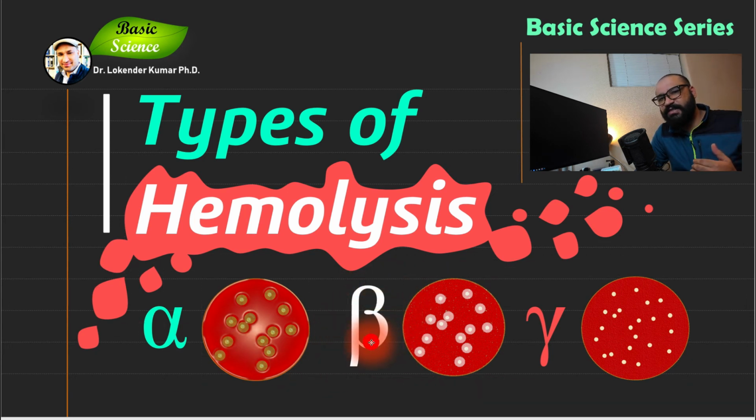Beta hemolysis indicates that there will be complete or true hemolysis, and the zone will be clear. That is why I'm using white color for beta. Third, I'm using red color for gamma hemolysis, because there is no zone of hemolysis, and basically the media will appear red, the same color of the blood agar, right?